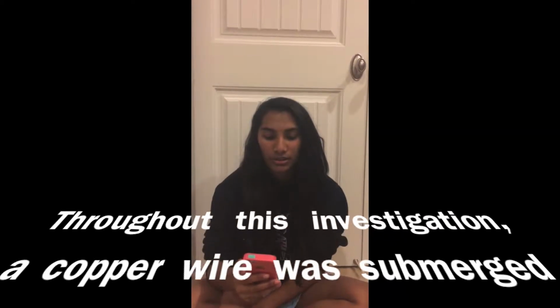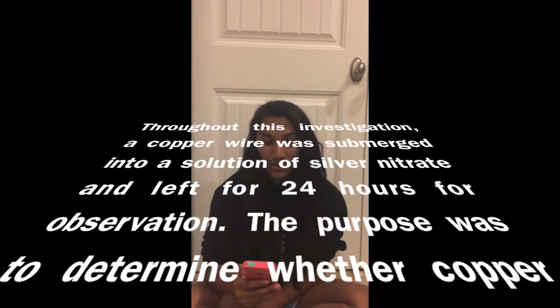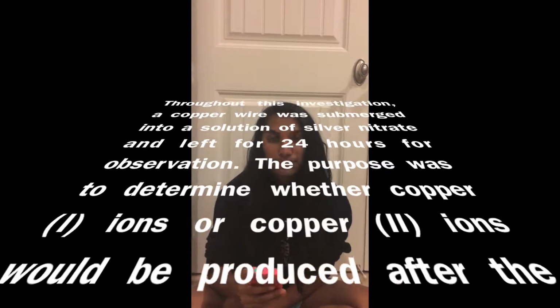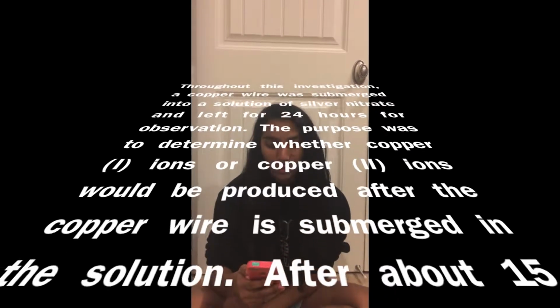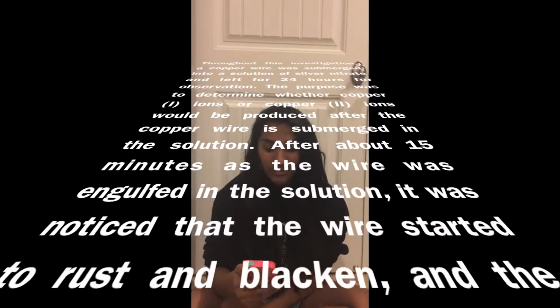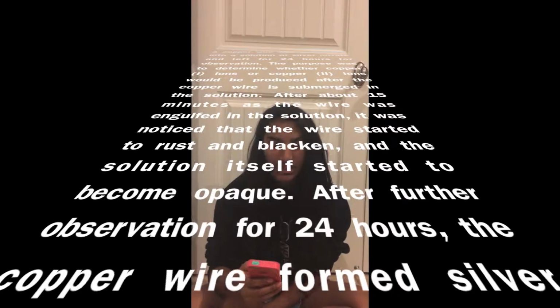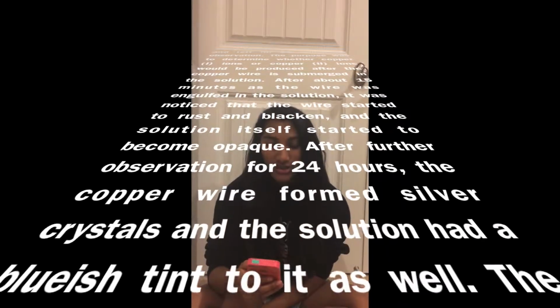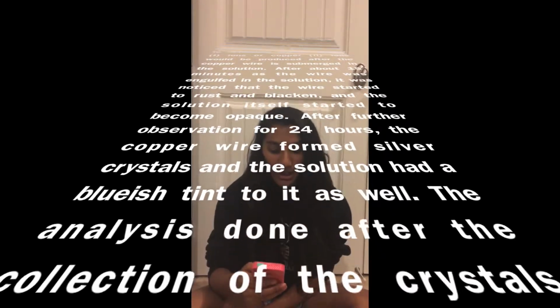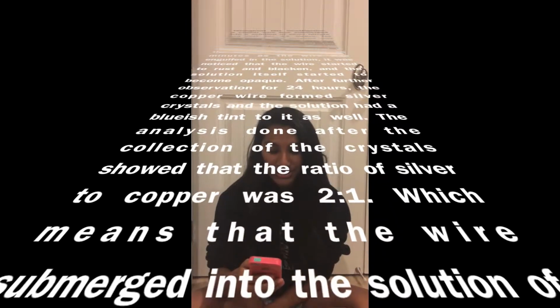Throughout this investigation, a copper wire was submerged into a solution of silver nitrate and left for 24 hours for observation. The purpose was to determine whether copper 1 ions or copper 2 ions would be produced after the copper wire was submerged in the solution. After about 15 minutes as the wire was engulfed in the solution, it was noticed that the wire started to rust and blacken, and the solution itself started to become opaque.